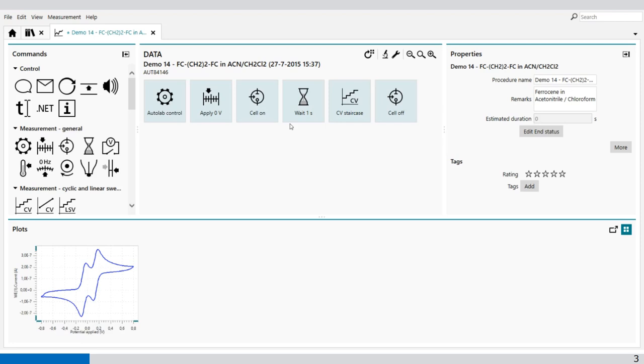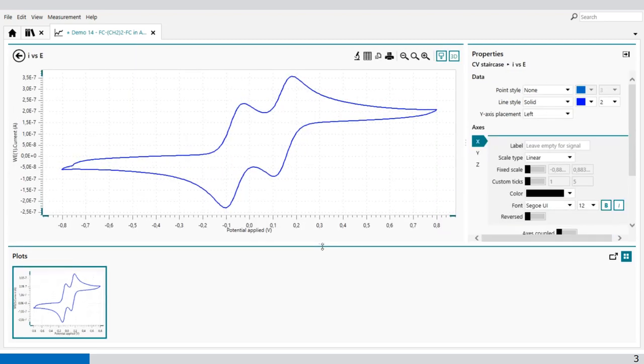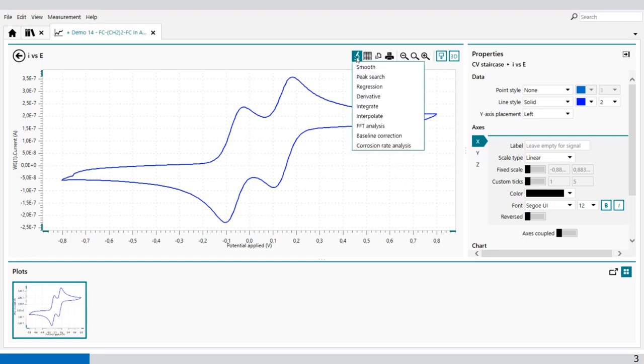This is the cyclic voltammetry voltammogram with a few peaks in it. Open the plot, and in the plot you can add an analysis command by selecting the microscope. For example, peak search.